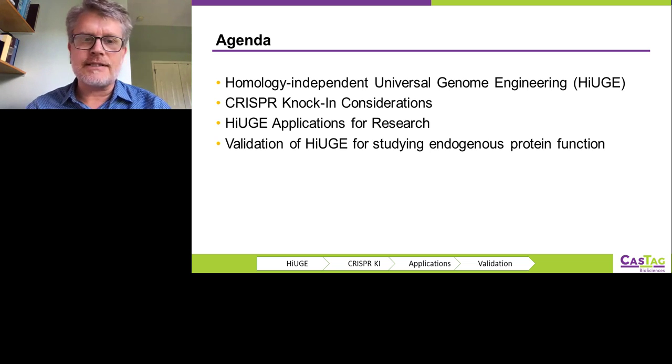to other existing technologies. I'm then going to quickly cover through some of the considerations that you might want to think about and go through as you're considering a variety of different types of knock-in experiments using CRISPR-Cas9 and how these can be addressed using this new approach.